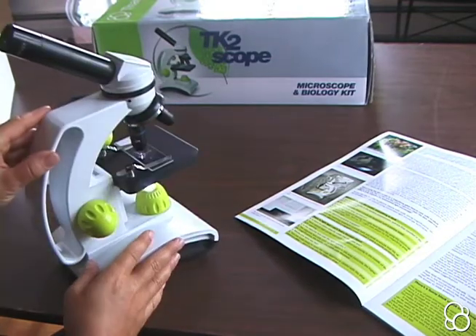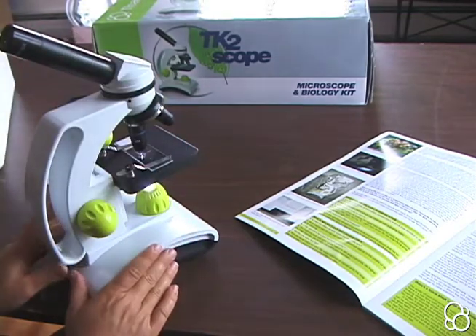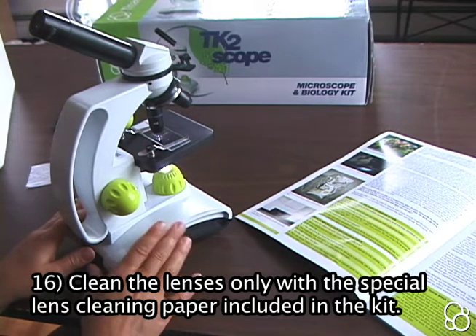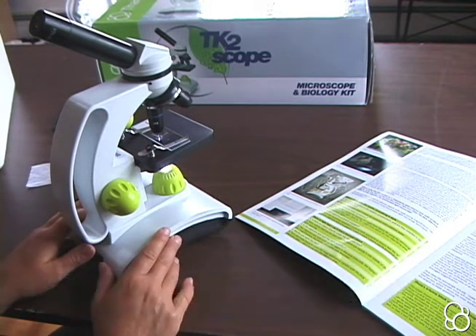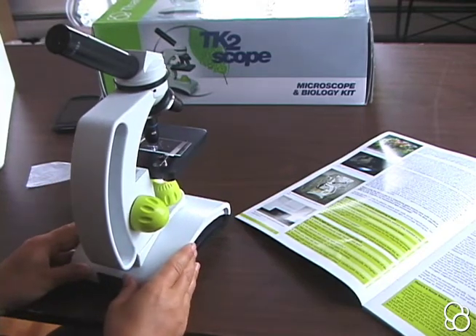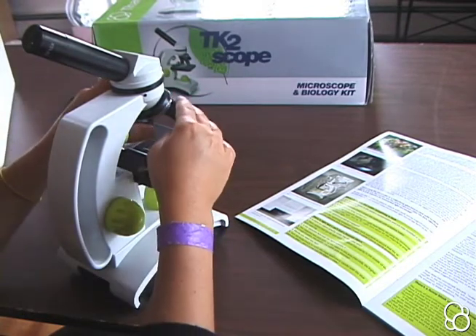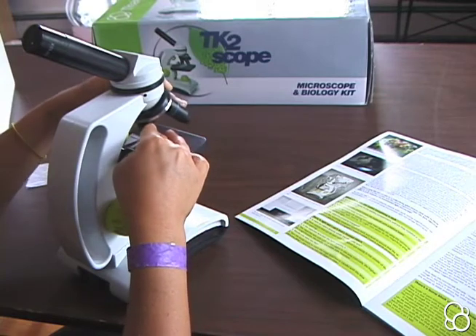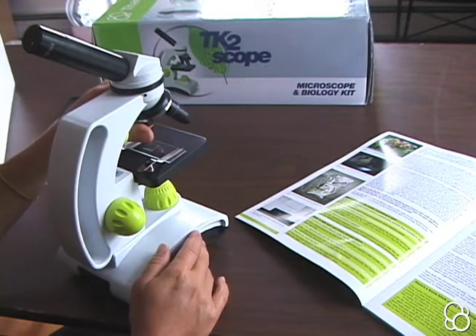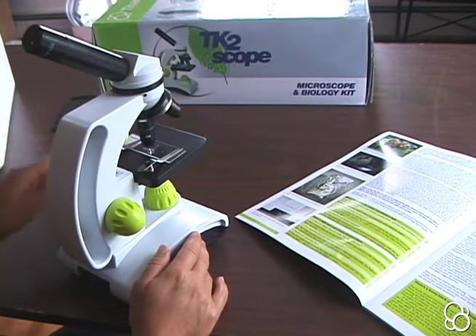If any of the objective lenses or the ocular lens ever get dirty, you can clean them with the special lens cleaning paper that comes in the kit. Never use water or cleaning agents. For each new thing you're looking at, it's suggested that you start with the lowest magnification first — the red objective lens — then move to the yellow, and finally if you're using it as a microscope, move to the blue objective lens.